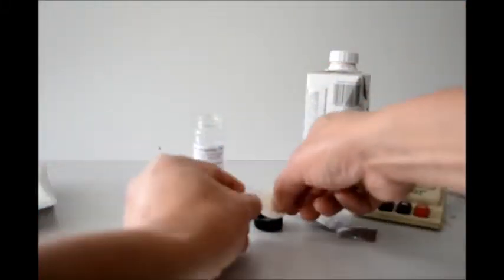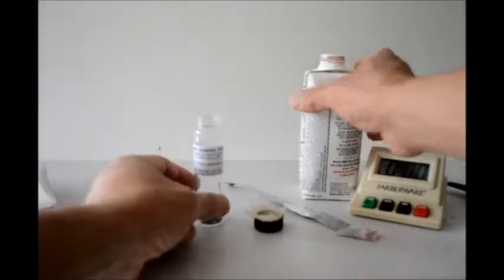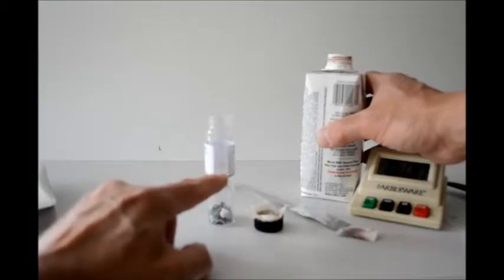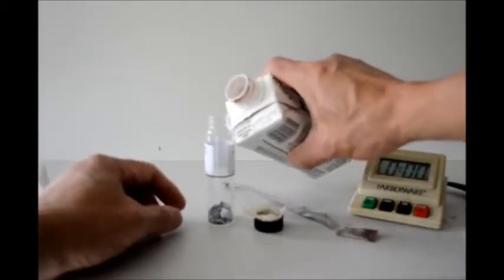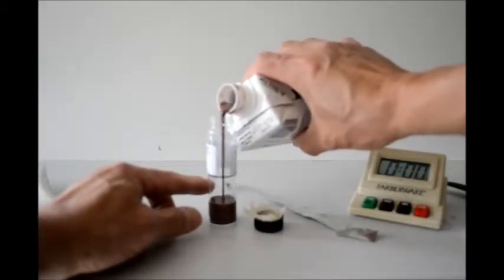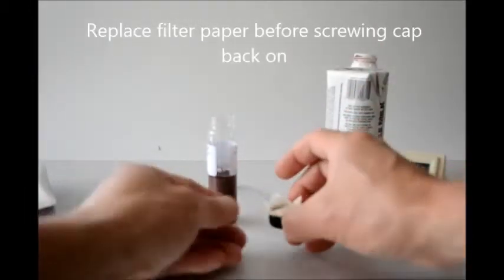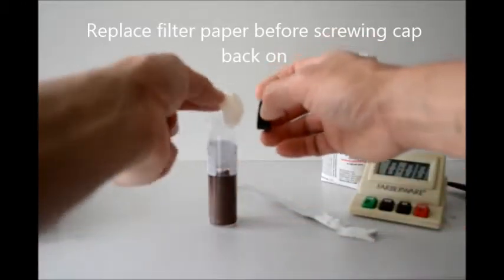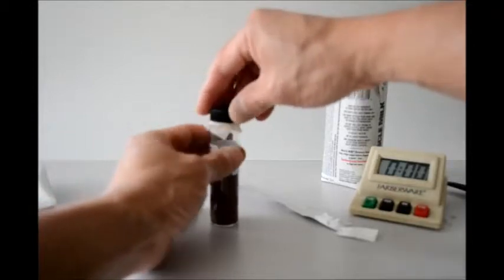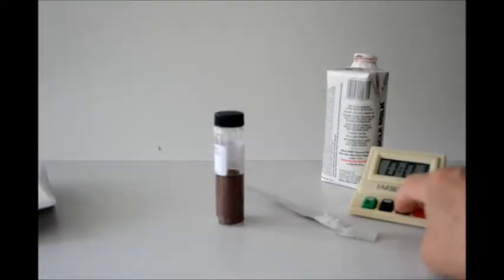I will put the filter paper back onto the cap, then pour an amount of the shake into the detector up to the mark here. With the filter paper back on, I'll screw the cap back on. And now we will wait for 30 minutes.